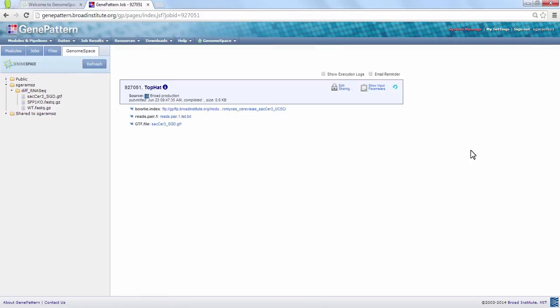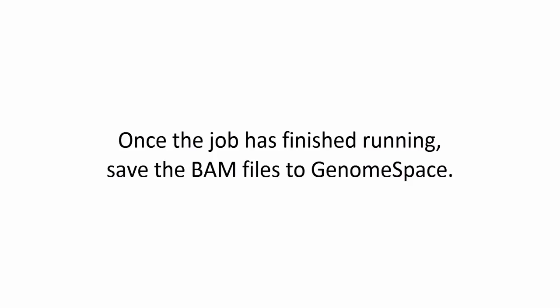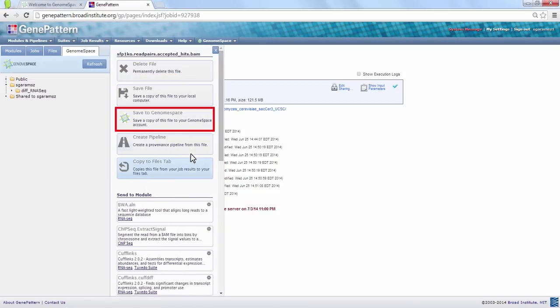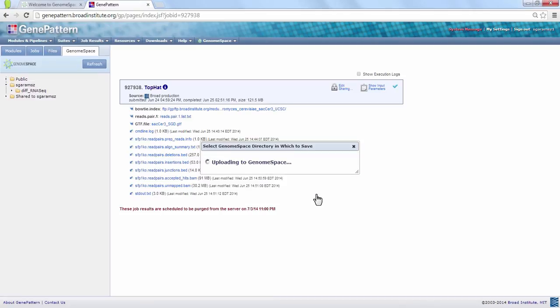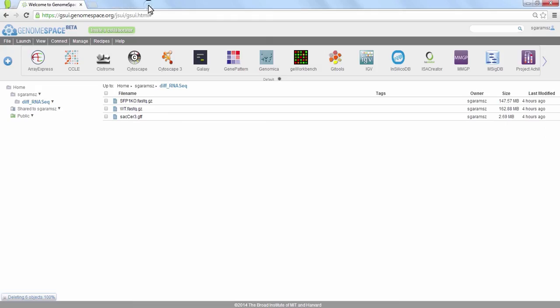Click Run. TopHat can take several hours to run on the GenePattern public server, depending on your place in the queue and the size of the files being aligned. Once the job is finished, save the BAM files to GenomeSpace. This is easily done by clicking on the appropriate files under the completed job, choosing Save to GenomeSpace, and selecting a directory. Remember to return to GenomeSpace and refresh the directory to view your files.